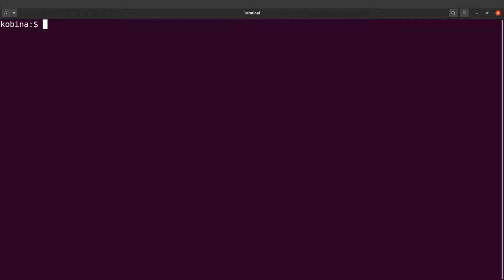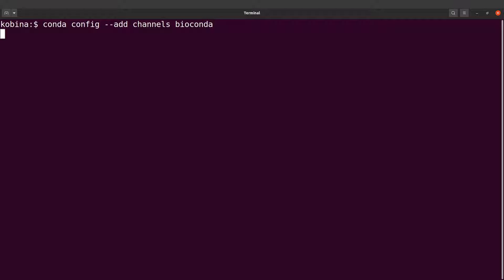What we are going to do first is to add the conda channel. We are going to add bioconda. So we type conda config add channels and we specify the channel name which is bioconda. So let's run this command.